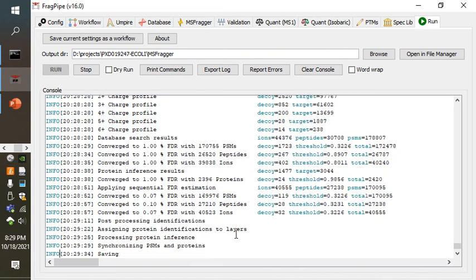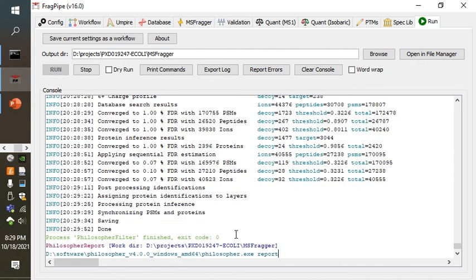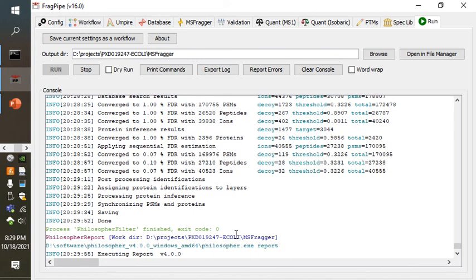Is it big enough is probably the question that should come to mind, though. Do we have a guarantee that just because a protein is one that's detectable by top-down proteomics, that it will also be identified with a relatively quick 1D shot in bottom-up proteomics? That is an interesting question, because some of the proteins that are detectable by top-down proteomics are not necessarily mass spec friendly at the peptide level.